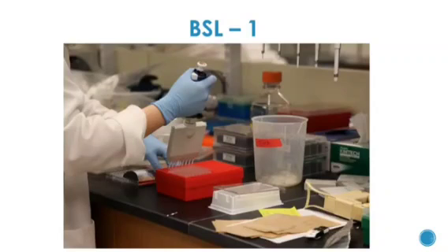The image shows the work being done on the open bench top following standard microbiological practices, and the personnel is wearing a lab coat and gloves based on the need of the work being done.